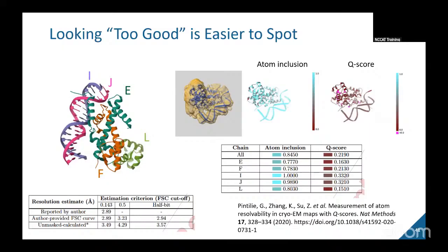Like, how would you interpret a good versus a bad Q-score? No matter what I do, I always inspect maps visually, with the model inside. But with the Q-score, you just have to remember that beyond 2.5 angstroms, as the density loses features, it becomes less meaningful. By the time you get to 4 angstroms, you've lost enough atomic detail in your map, it's noisy enough that it's not very informative. So I think the range where you can really be paying attention is anything below 3.7 to 4.